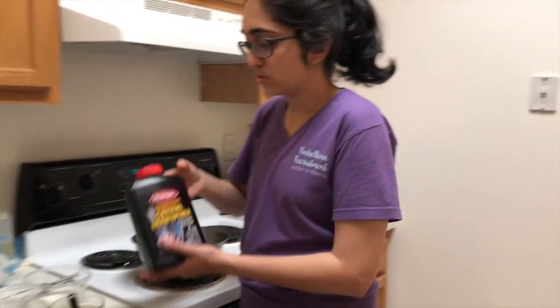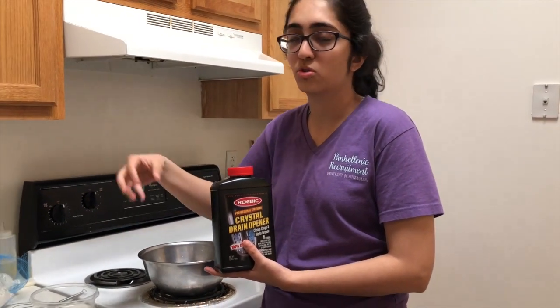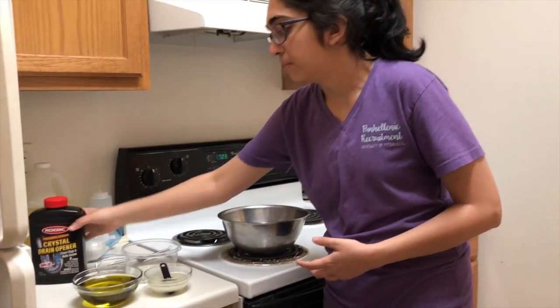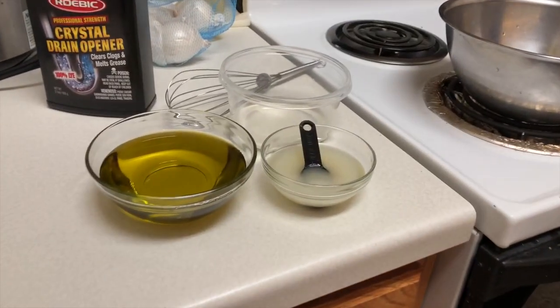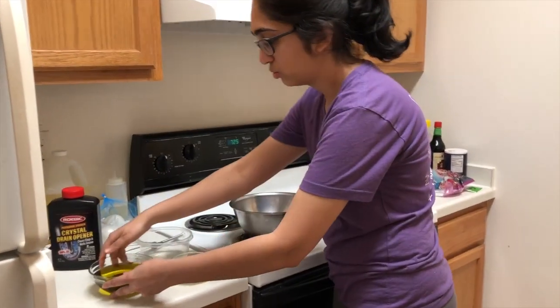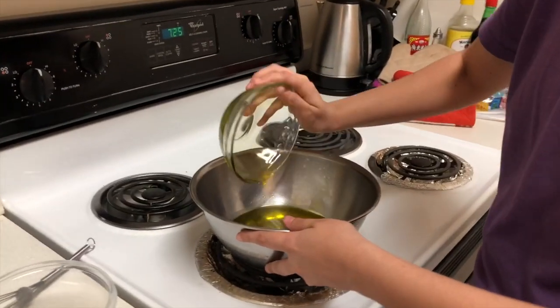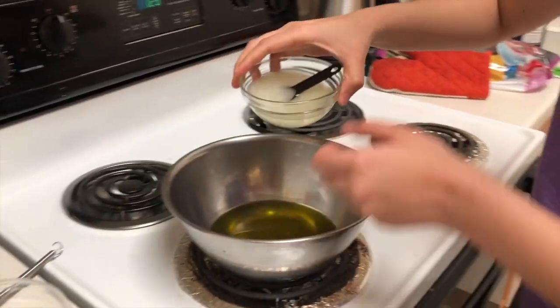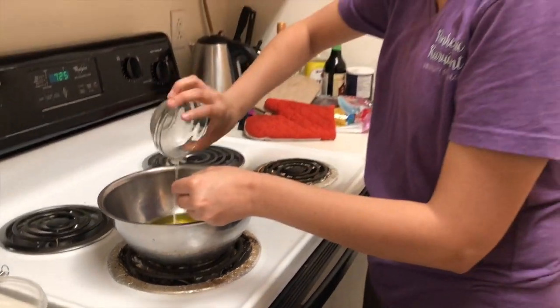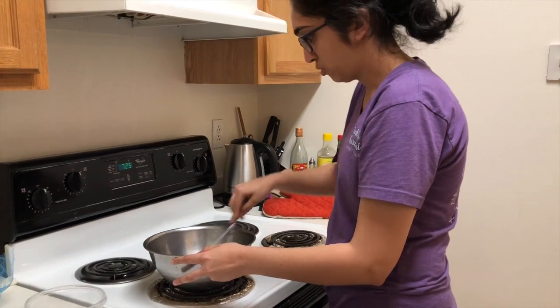So there are three main ingredients. First off is the sodium hydroxide. We're gonna have it in solution form, so you'll dissolve it in water. The next thing is olive oil, and the last thing is coconut oil. So first I'm gonna take the oils and mix them into a bowl. We're gonna make sure they're well mixed.